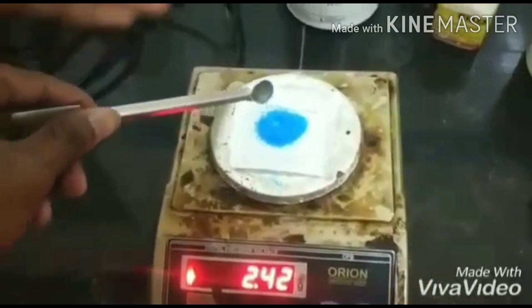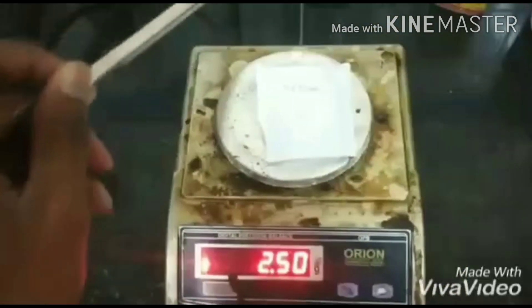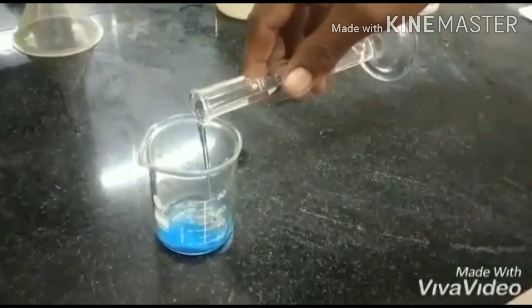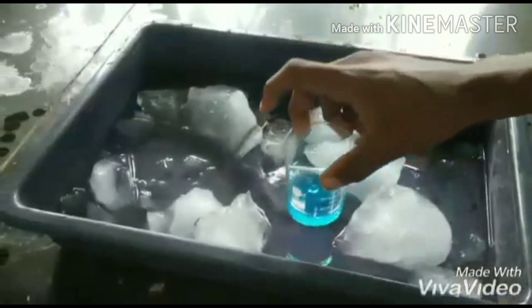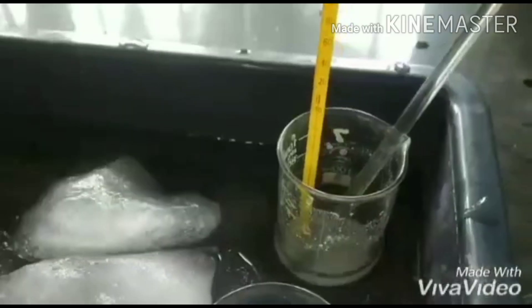First, we have to weigh about 2.5 grams of copper(II) sulfate and 2.5 grams of thiourea and transfer them into separate beakers, each containing 15 ml of distilled water. Stir well, and both solutions are kept in an ice bath until the temperature reaches below 10 degrees Celsius.